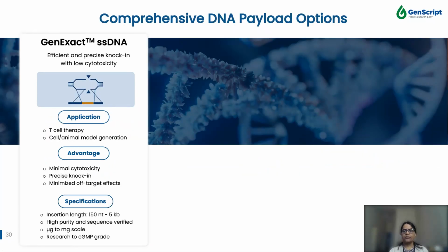One powerful application of CRISPR-Cas genome editing technology involves precisely inserting DNA templates through the HDR pathway. Selecting a suitable HDR template is very critical.